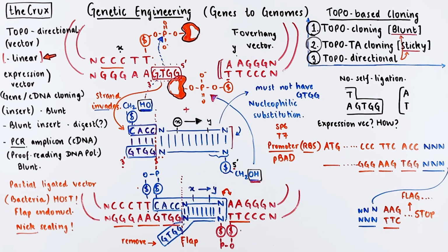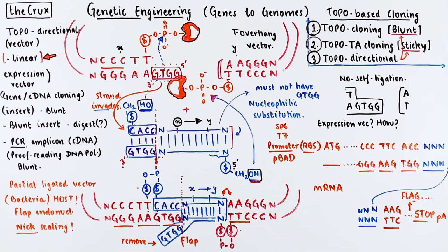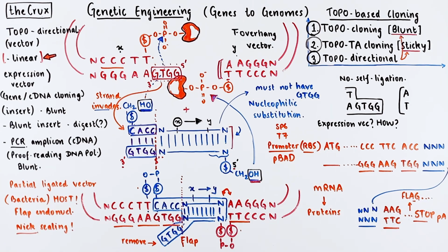Depending on the promoter in the front, you may have some specific terminators or poly-A signals at the end of this expression cassette. So this way you can use the cloned insert, which is a template for making RNA or even proteins from those RNA.